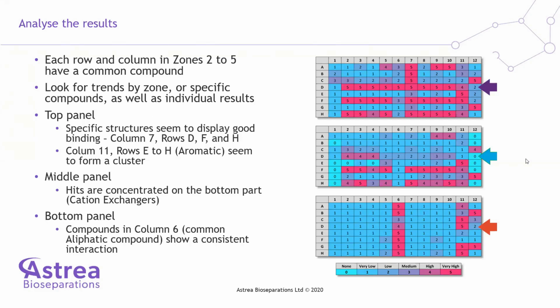Because the hits are distributed in the different quadrants of the ligand, this is giving us more of a trend in terms of which ones are more interesting, but not one specific that would be more promising. So we would have to look at that, and I'll go into more detail in a second. In the middle panel, you can see that that's essentially the same thing.